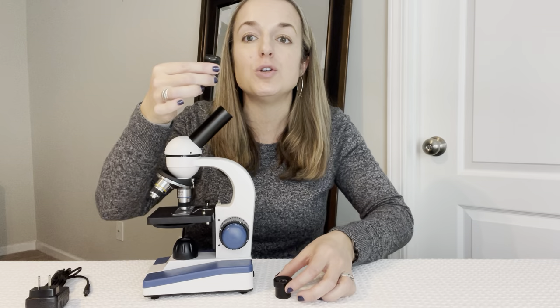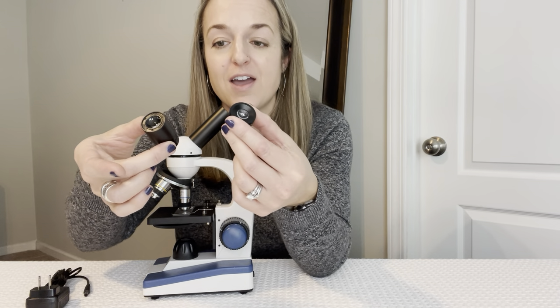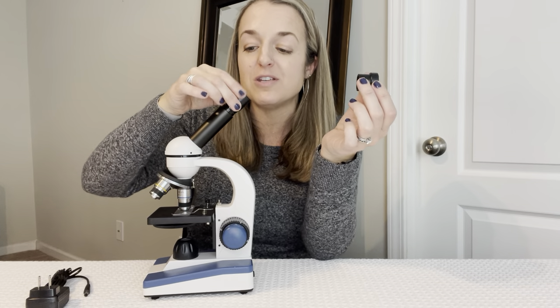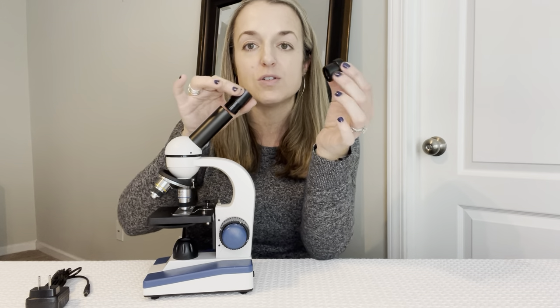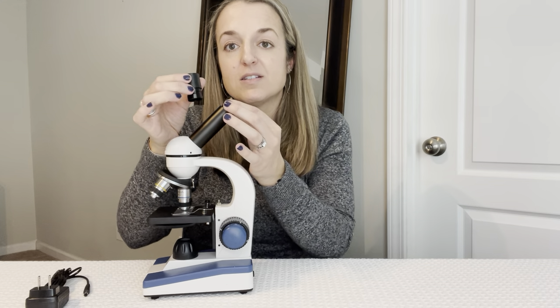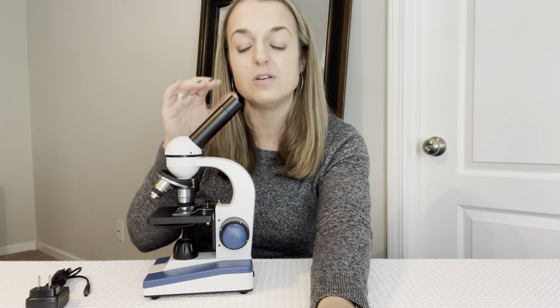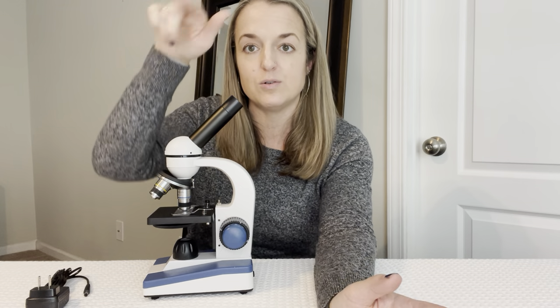It also comes with two lenses — one that's x10 and one that's x25. The way that you switch them is you just lift them out. There's no screwing; you just lift them out and place them in. The x10 one has a little needle inside that you can rotate, and the needle will rotate around.